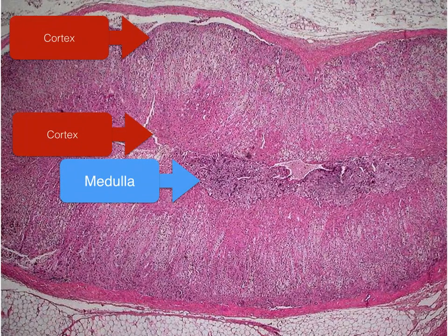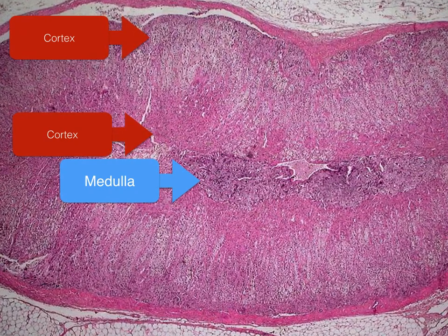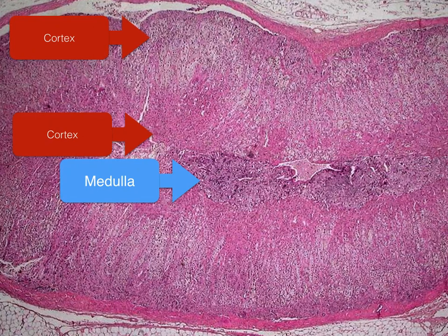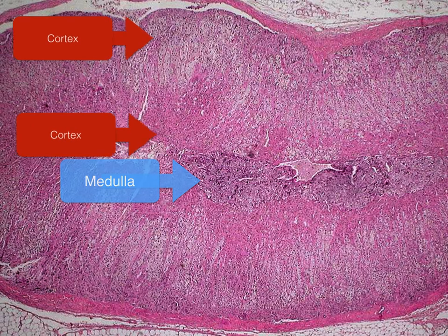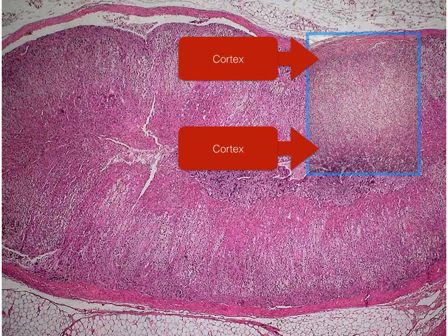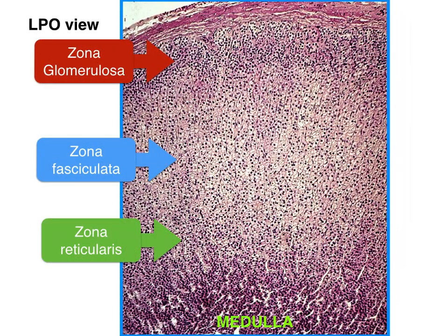At scanner view, we can see that the adrenal gland has two distinct parts: the cortex and the medulla, which differ in structure, function, and embryological origin. The adrenal cortex is organized into cords arranged radially around the medulla. The cortex is divided into three sub-layers: zona glomerulosa, zona fasciculata, and zona reticularis.